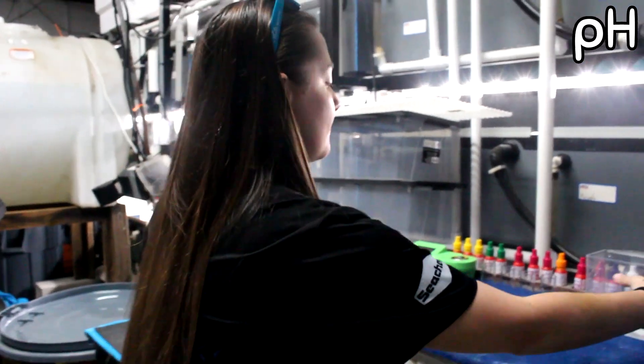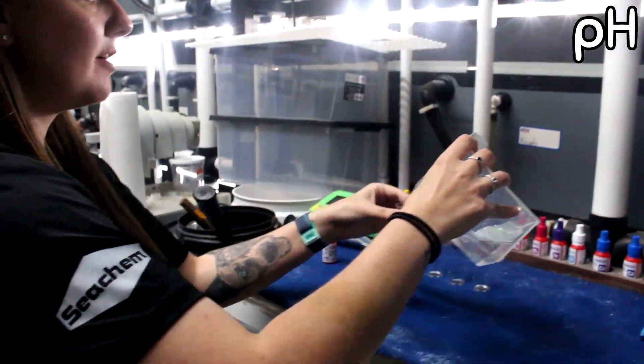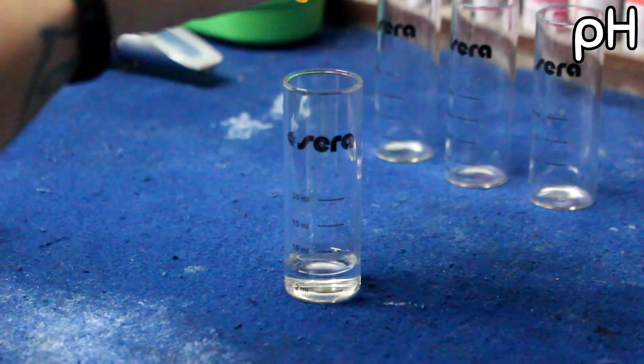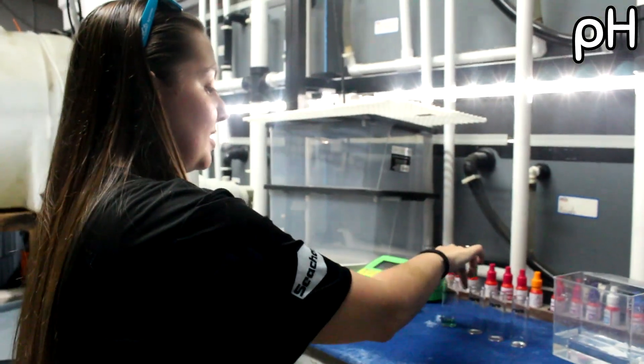First I'm going to test pH. On the bottle it says to put four drops into five milliliters of water — and it's going to be five milliliters regardless of whether it's salt or fresh. So I just pour five milliliters of water in there and put in four drops: one, two, three, four. By the way, I am testing one of my saltwater systems.